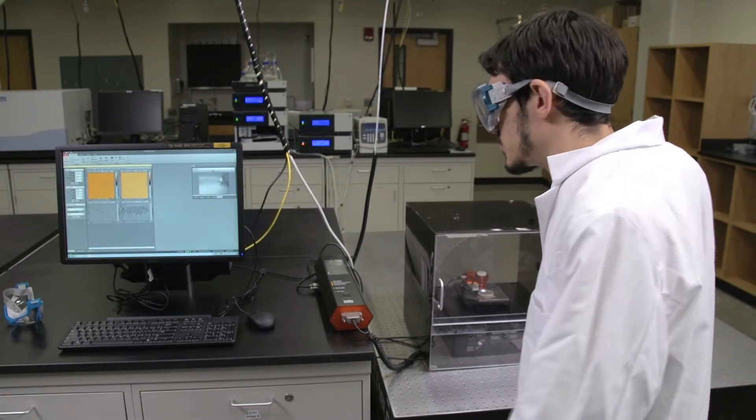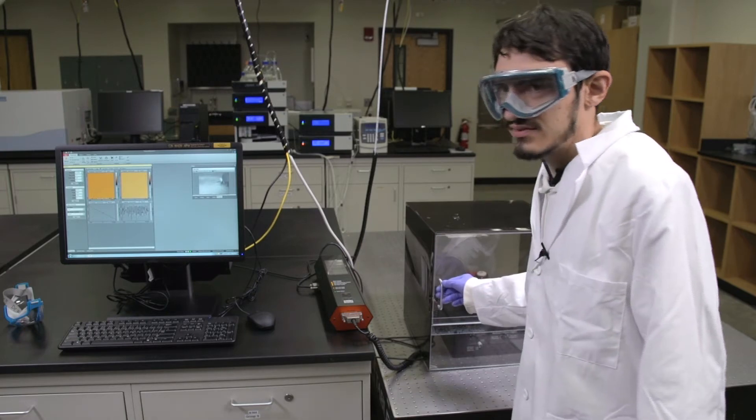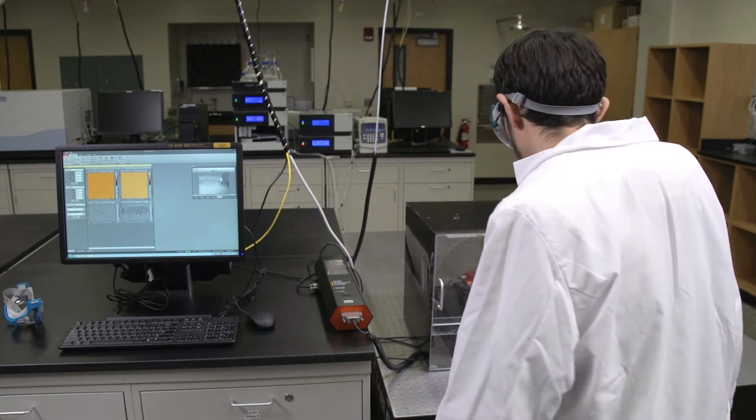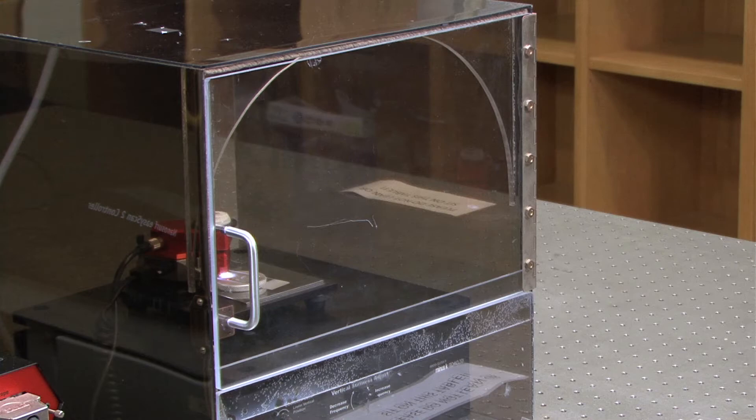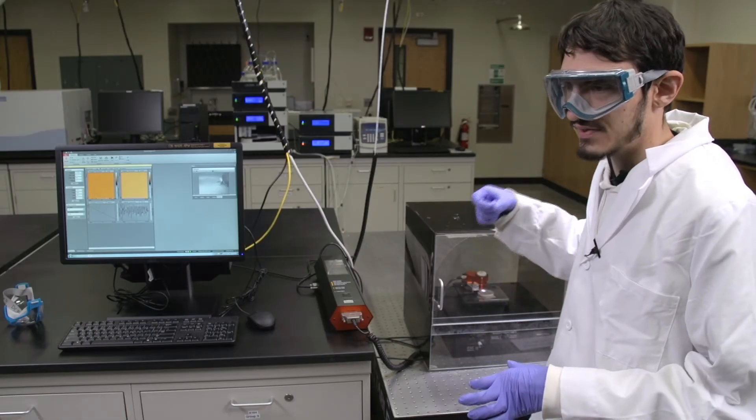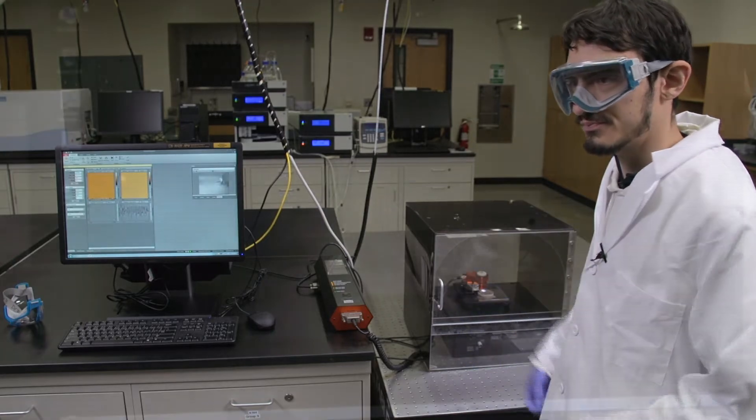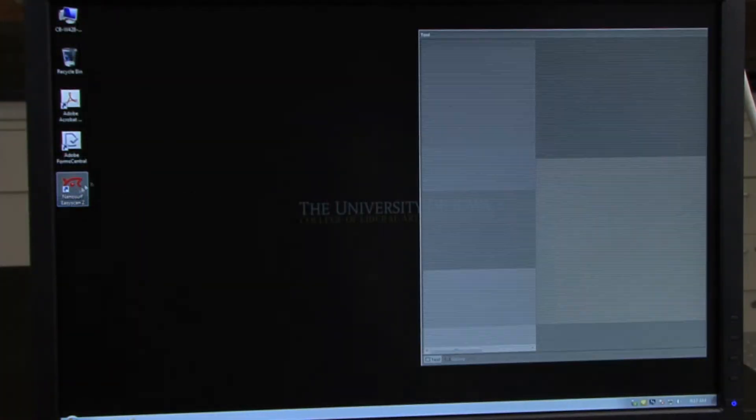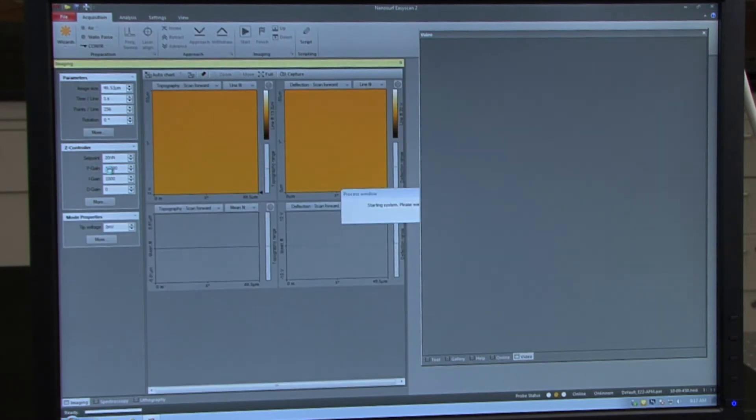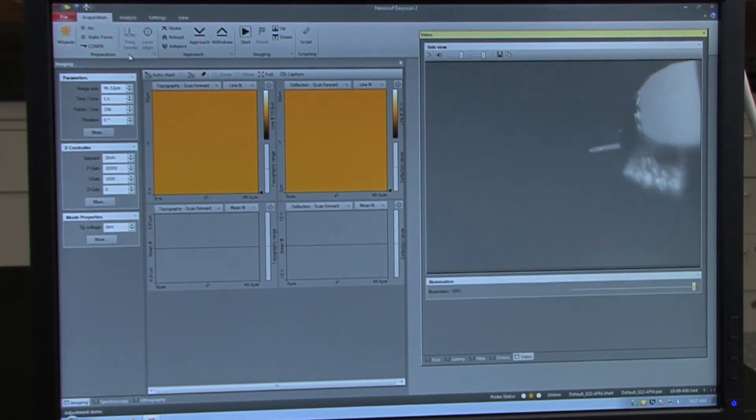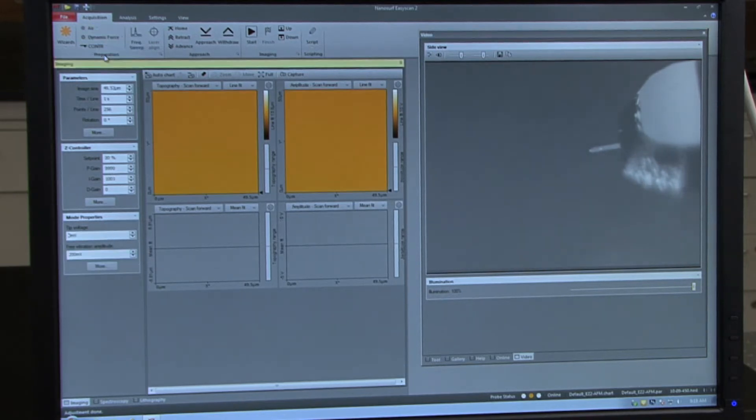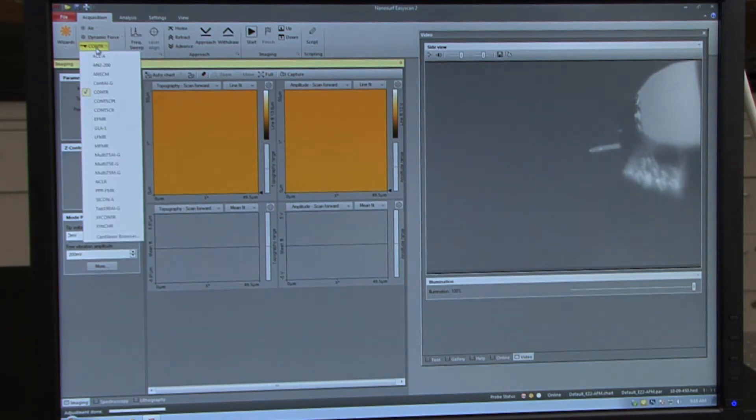Prior to operating the software, be sure that the door to the draft box is closed over the AFM instrument. And also be sure that the AFM is level by looking carefully over the head at the bubble within the black circle. Open the NanoSurf EasyScan 2 software after the power supply to the AFM has been turned on. Under the acquisition tab that comes up, change static force to dynamic force and change the tip type, which is under that, to ACL-A.